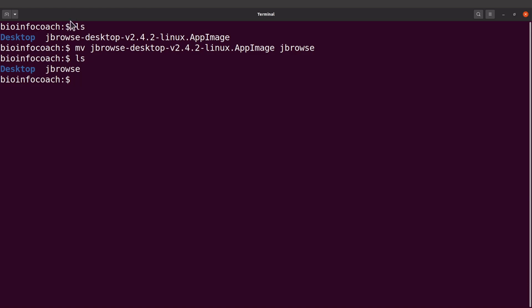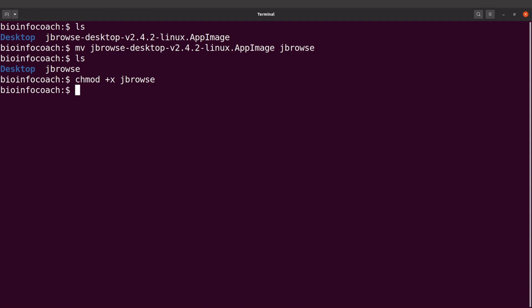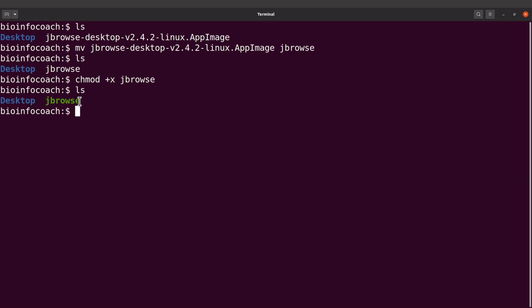If I do an ls I will see that the file has been renamed. Next I'm going to add execution rights so I can always execute it. I'll say chmod +x and supply it with the name. Depending on the platform you're using, the color of the file may change, but once you've executed this command successfully everything is fine.